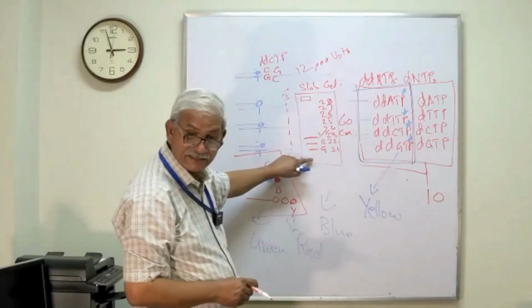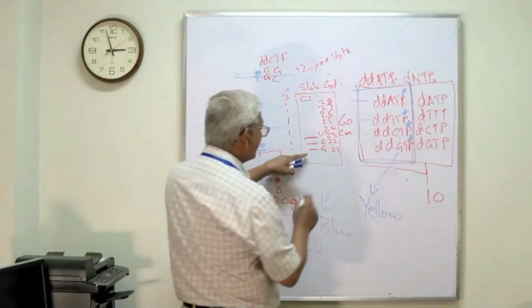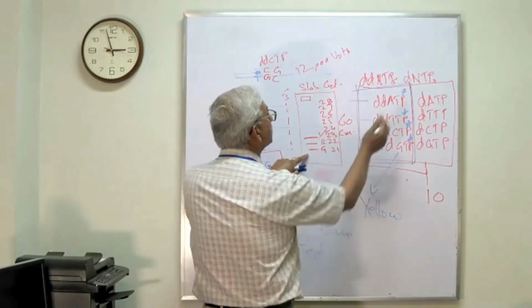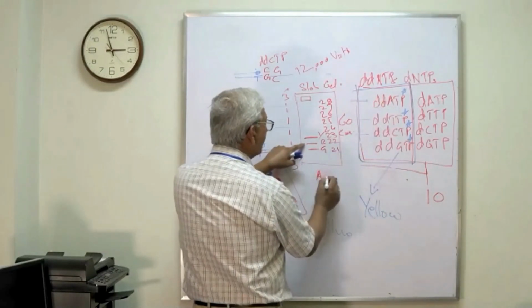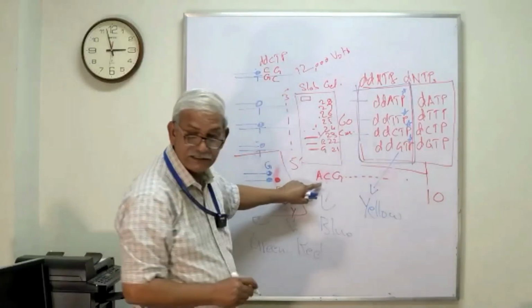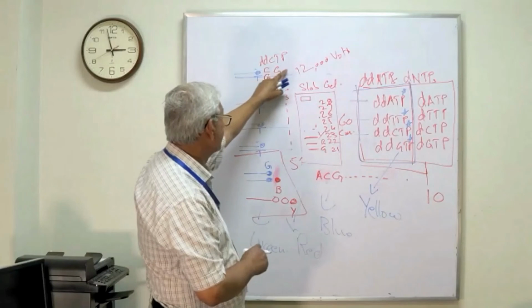And when we read the sequence, we read from bottom to the top. If this is green in color, this green represents ATP. So it is A, blue color is C, yellow is G, and so on. We will write out the sequence, and this will be the sequence of the newly sequenced strand. This one is the template, and this is the newly synthesized strand.